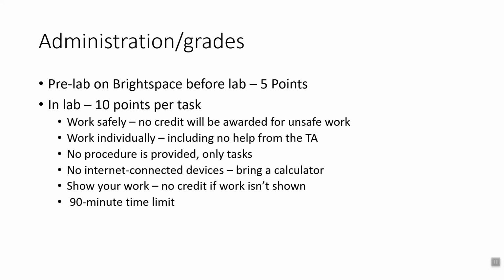So first things first, work safely. If you're occasionally taking your goggles off in the lab, this is not the week to do that because you will get a 0 for the lab. In no uncertain terms. Part of working in a chemistry lab correctly is working in a chemistry lab safely. If you're working unsafely, you will get no credit for this lab, and to be honest with you, you deserve no credit for this lab.